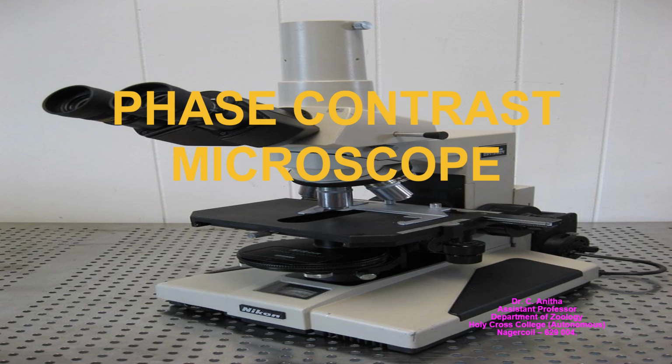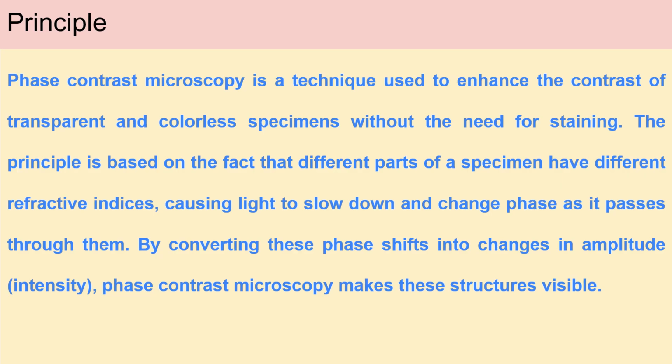Phase contrast microscope. Principle. Phase contrast microscopy is a technique used to enhance the contrast of transparent and colorless specimens without the need for staining. The principle is based on the fact that different parts of a specimen have different refractive indices, causing light to slow down and change phase as it passes through them. By converting these phase shifts into changes in amplitude, phase contrast microscopy makes these structures visible.